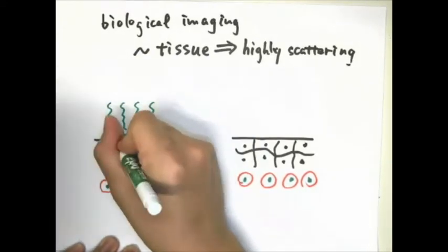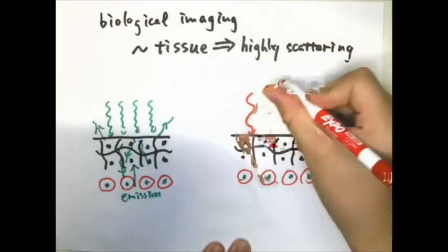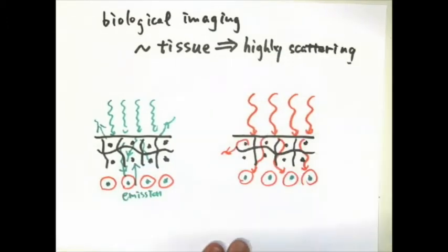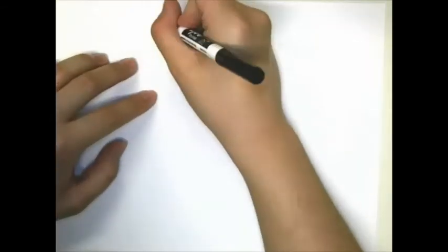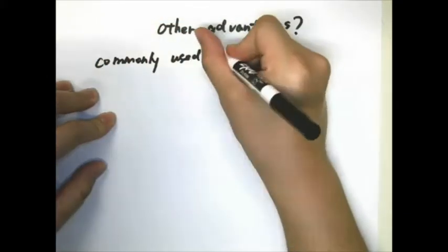In biological imaging, the deep tissue is highly scattering. The single photon from confocal microscopy has shorter wavelengths, which results in shorter penetration depths, whereas two-photon or three-photon from multiphoton microscopy have longer wavelengths, which can penetrate deeper into the tissue with less scattering.